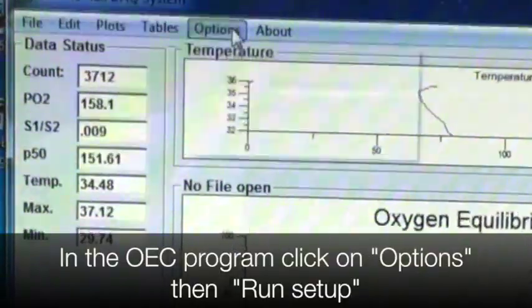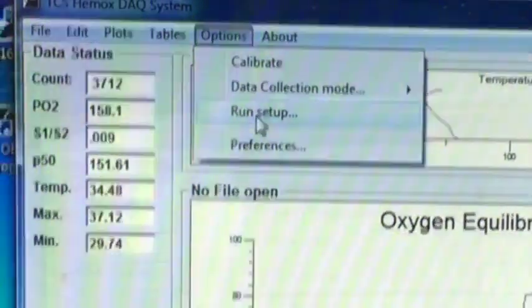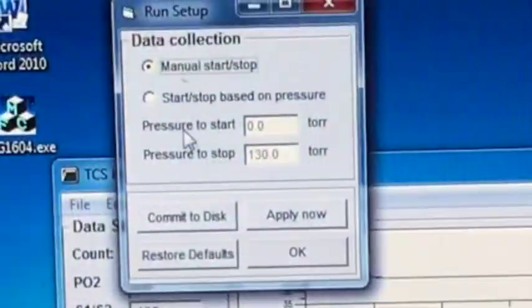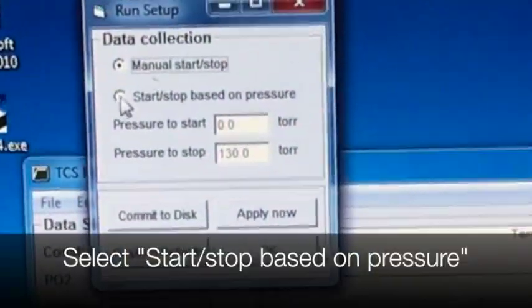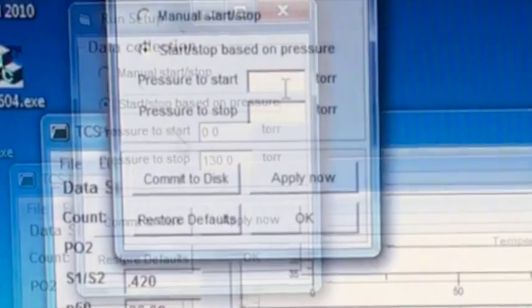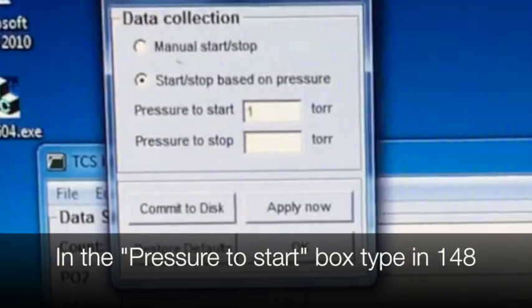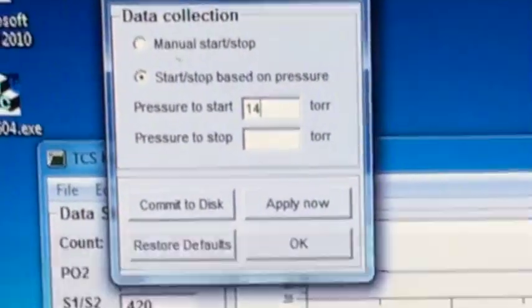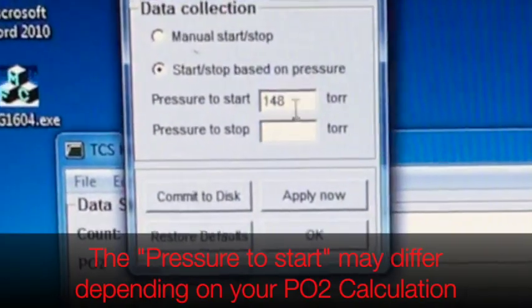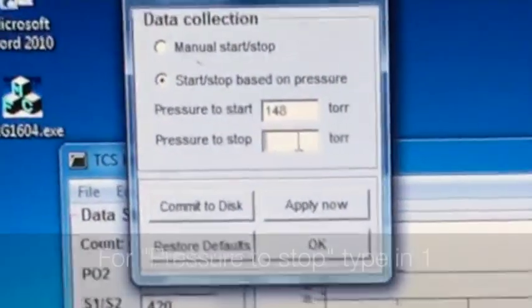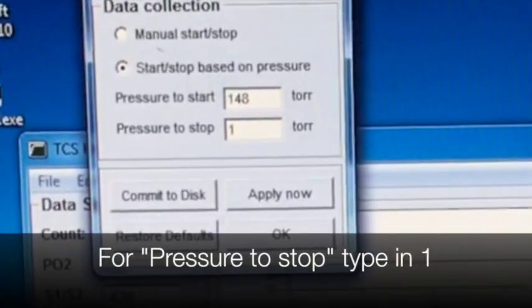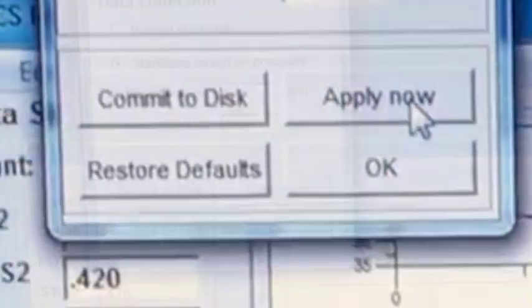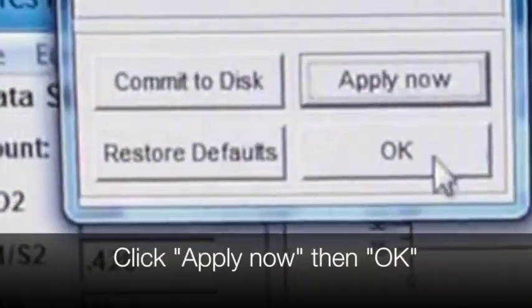In the OEC program, click on Options, then Run Setup. Select Start-Stop based on Pressure. In the Pressure to Start box, type in 148. Your PO2 calculation may be different. For the pressure to stop, type in 1. Click Apply Now, then OK.